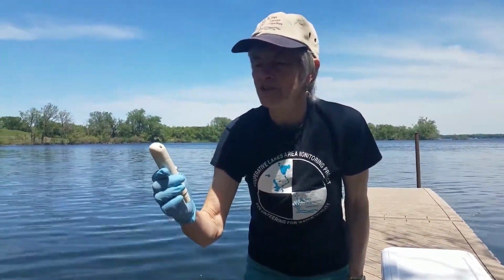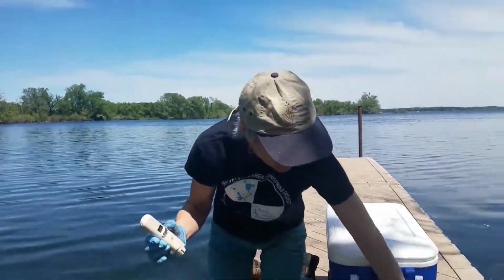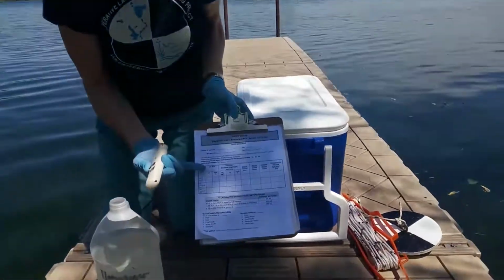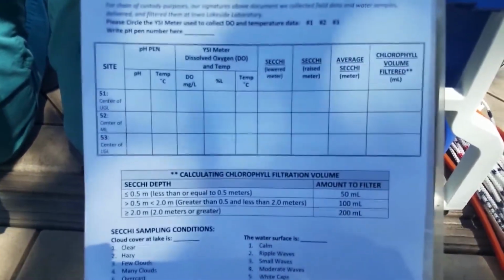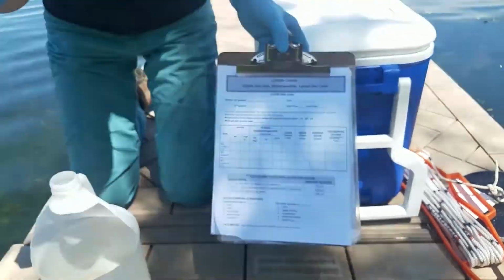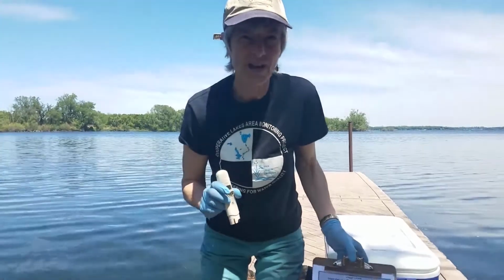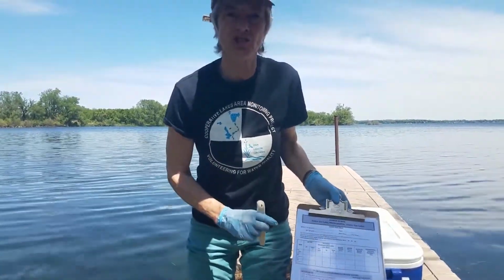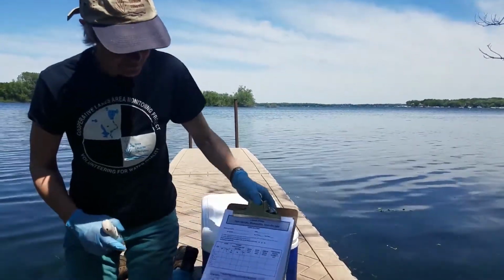We have 8.94, and the water temperature is 21.1 degrees centigrade. On your data sheet, you'll record the pH and the temperature. There's some more information in your manual. If your meter is on Fahrenheit, there's a way to switch it back to centigrade. You can read about that in your manual. Or you can write down the Fahrenheit and use the conversion chart inside your manual to convert it to centigrade.